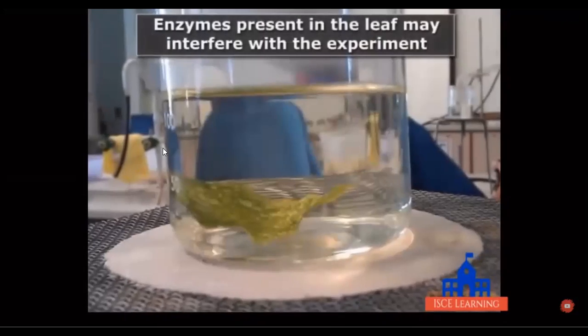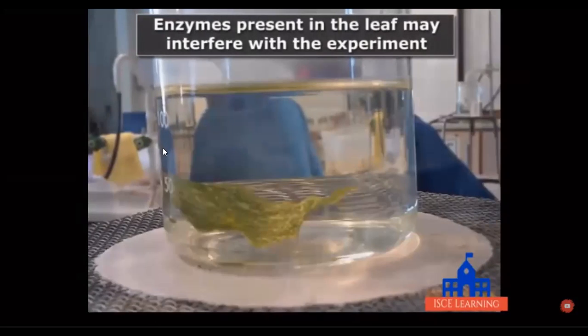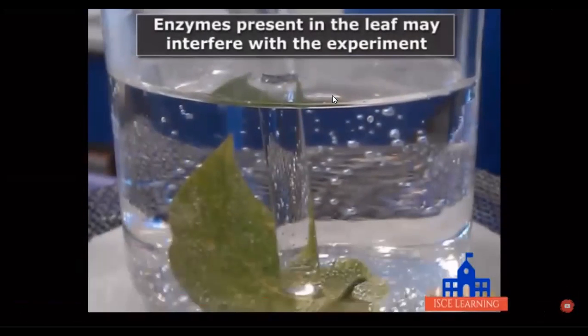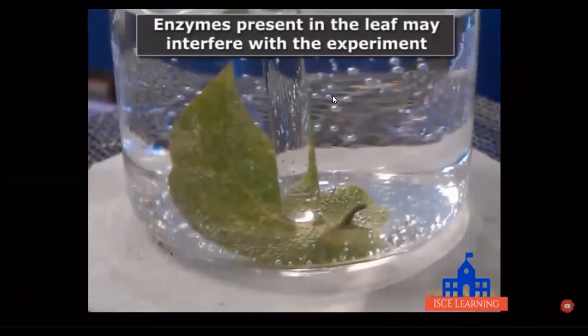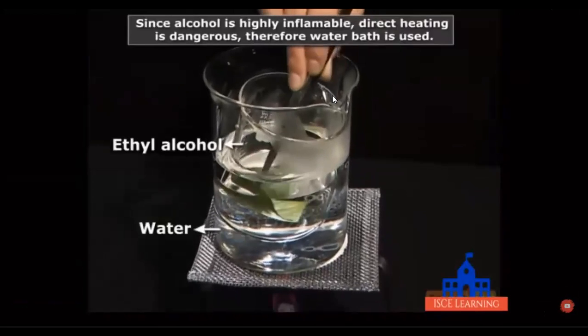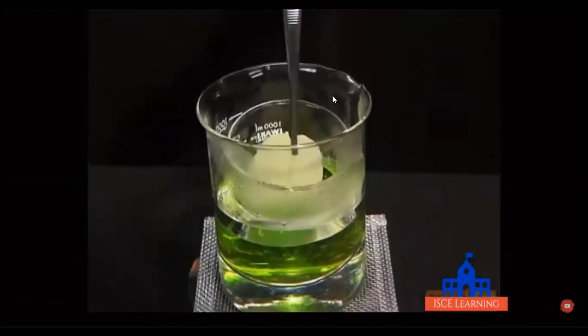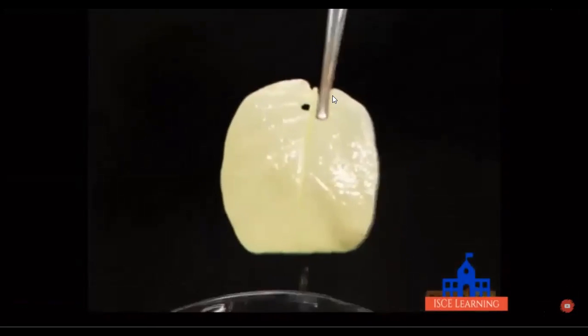Detached leaf from the plant is dipped in boiling water for 30 seconds. Boiling the leaf in water destroys the enzymes, thus prevents all the further chemical changes during the experiment. Leaf is then put in ethyl alcohol to dissolve the chlorophyll. Leaf gets decolorized due to the loss of chlorophyll pigment and becomes pale yellow in color.